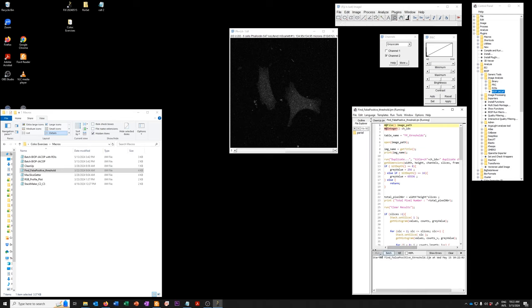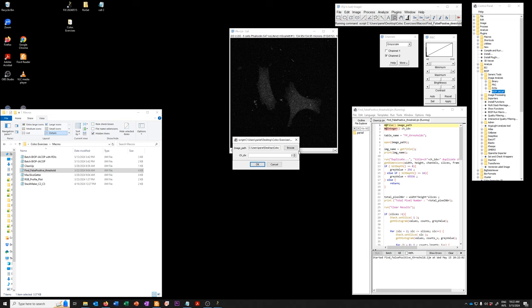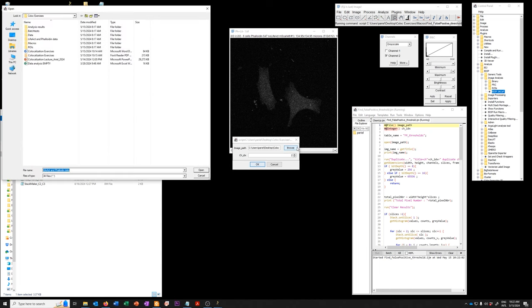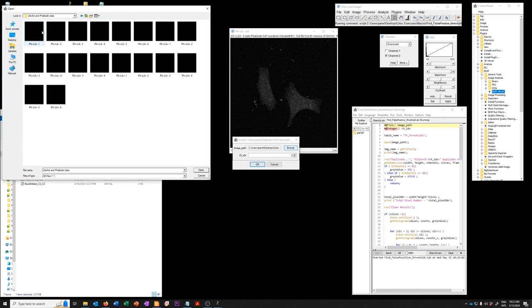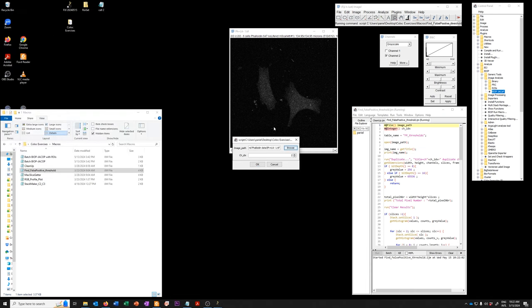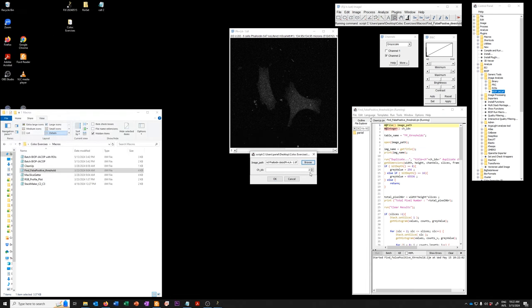So when you run it you have to tell it where the image is that you want. So in this case I'm going to use the image called PH plus LA minus, that means it doesn't have any LIFACT image number one. Now open that and I know that the channel that I care about is channel two, that's the LIFACT channel.